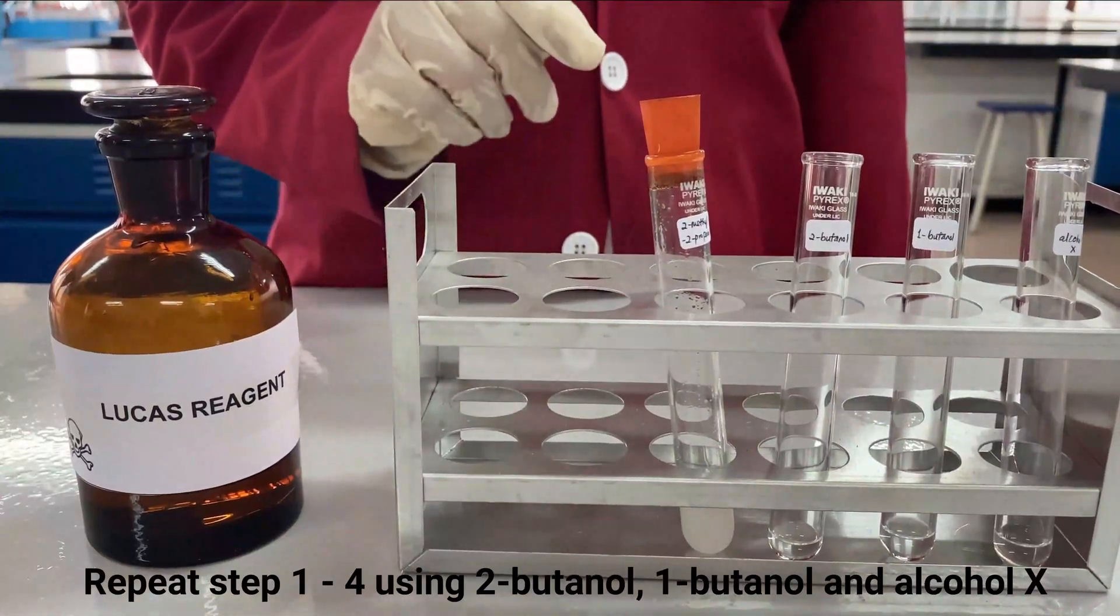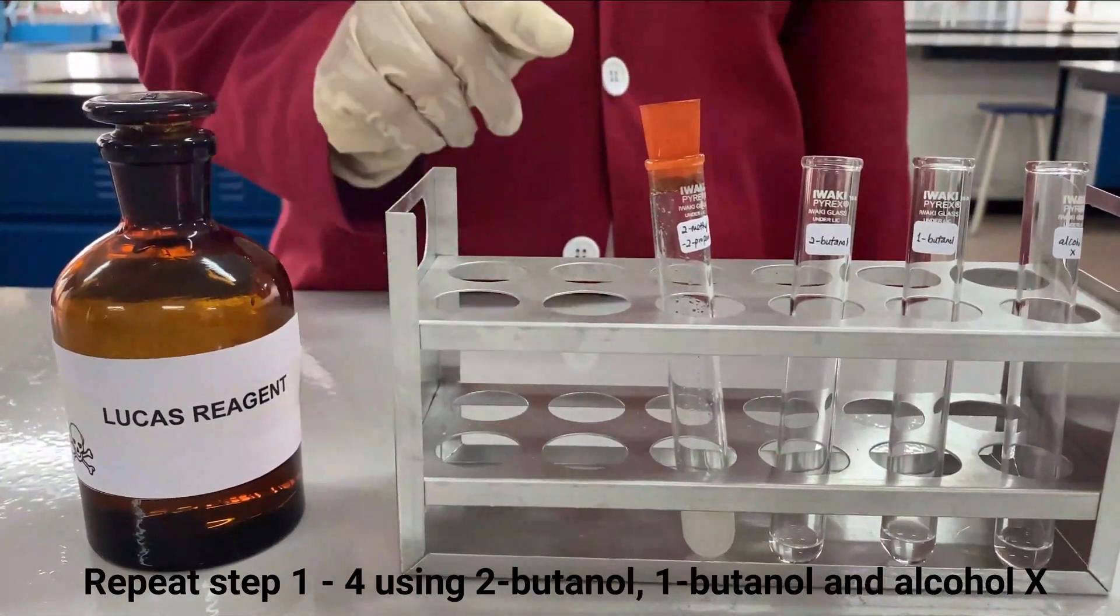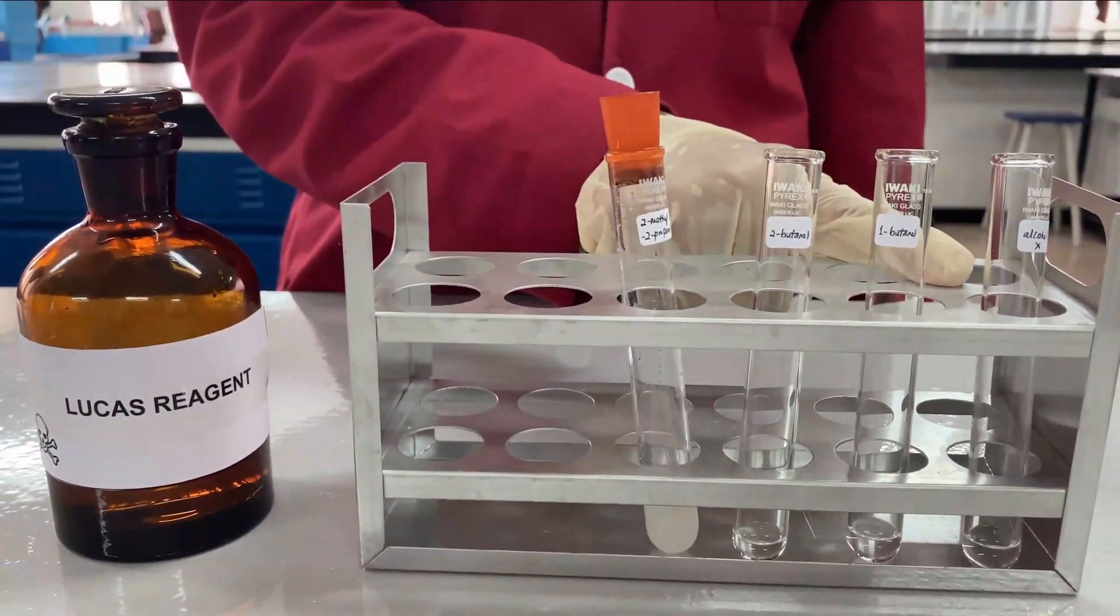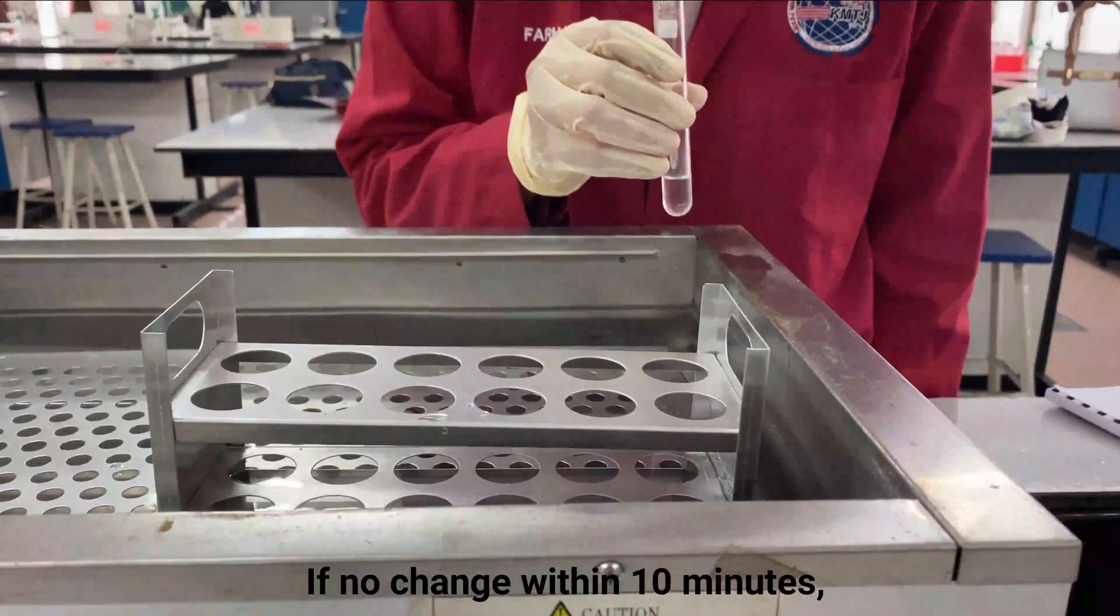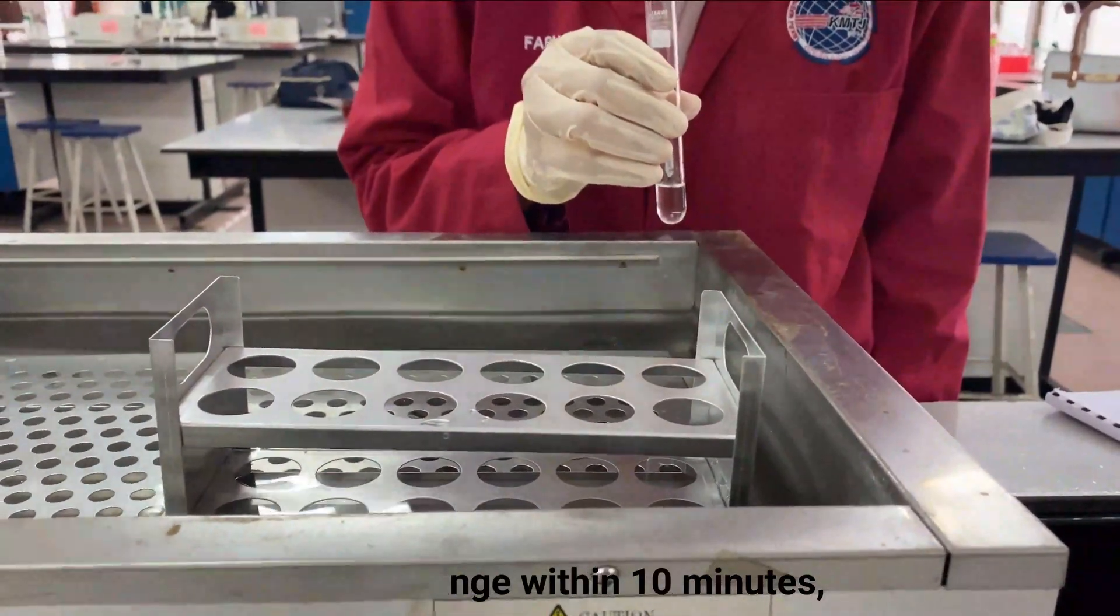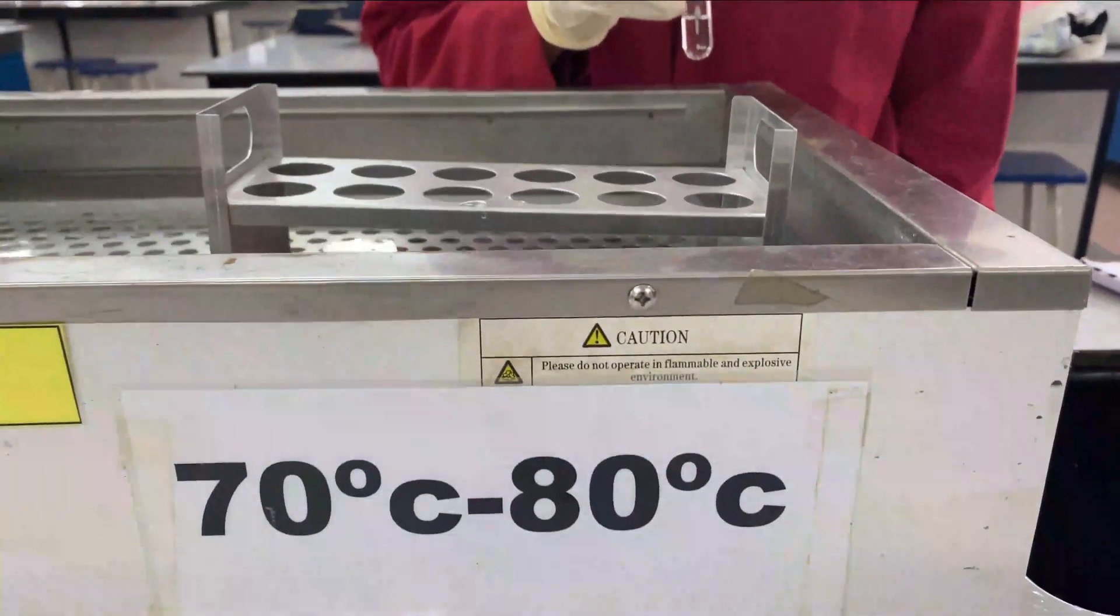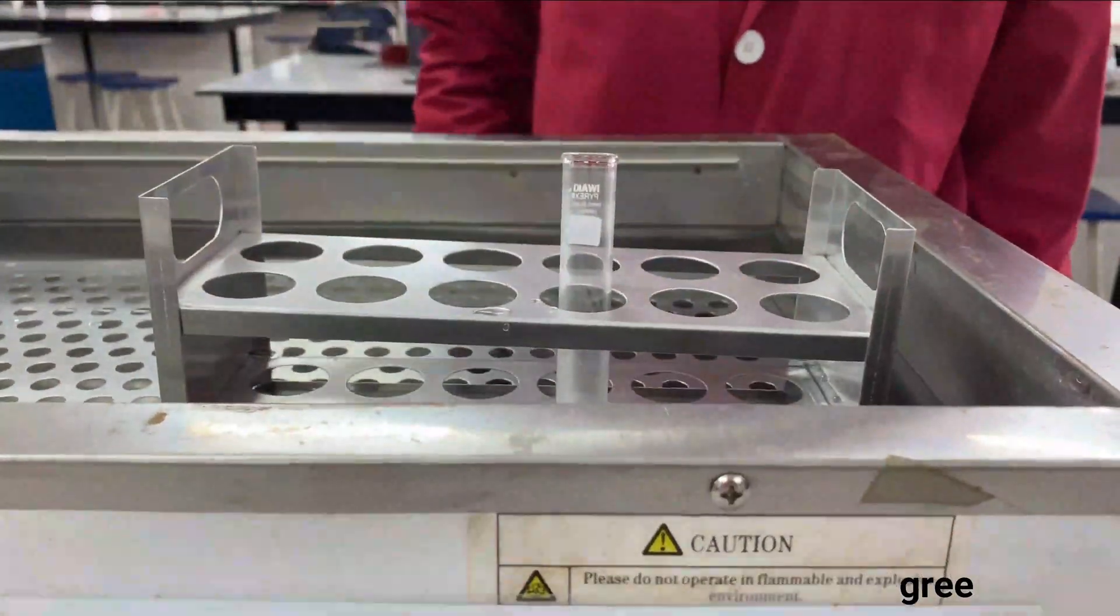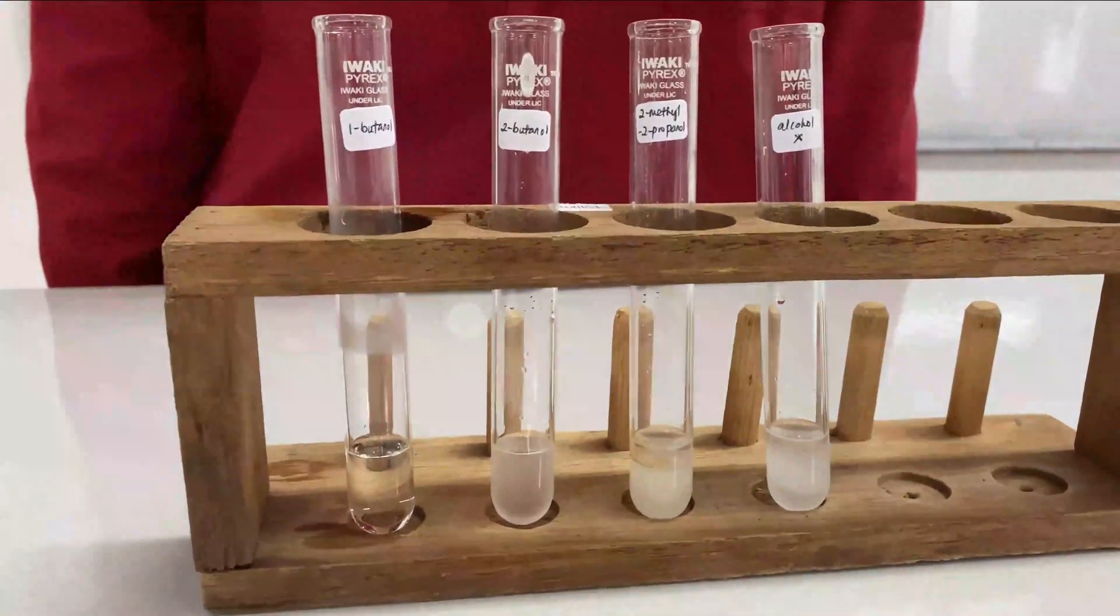Next, repeat steps 1 through 4 using 2-butanol, 1-butanol, and alcohol X. If there is no change within 10 minutes, place the test tube in the water bath at 70 to 80 degrees Celsius. Finally, deduce the class of alcohol X.